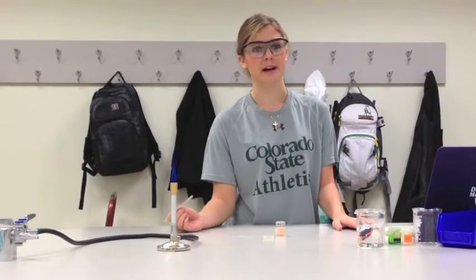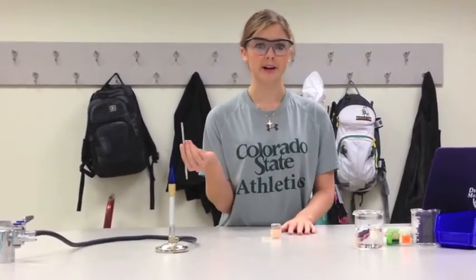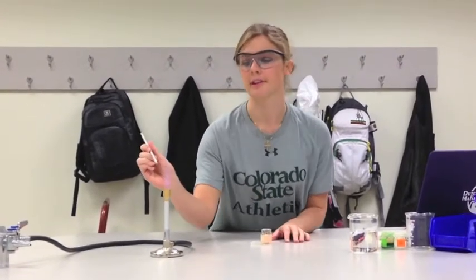If you're doing multiple compounds, repeat the sterilizing of the wire. Then, once the wire is cooled off, dip it into your other compound and repeat.